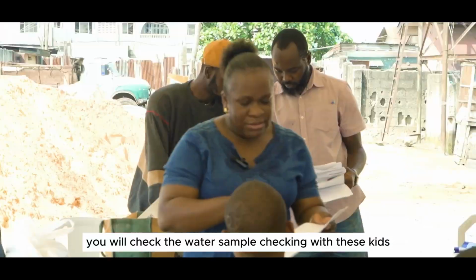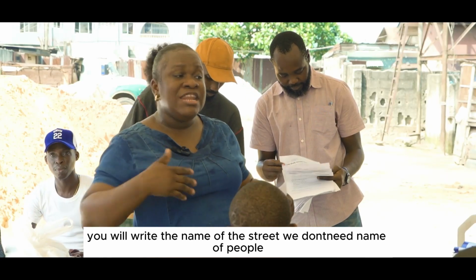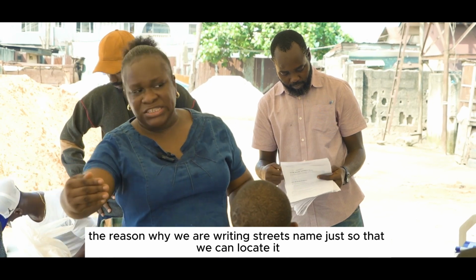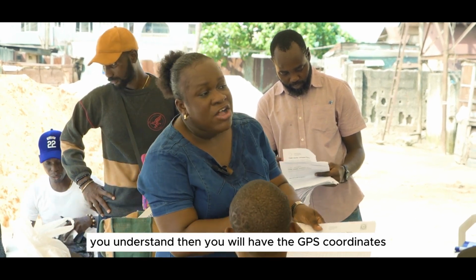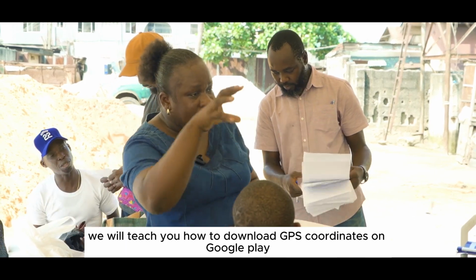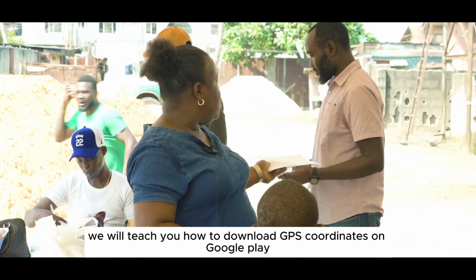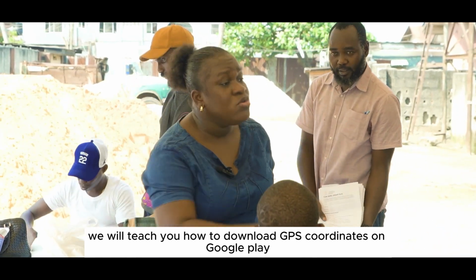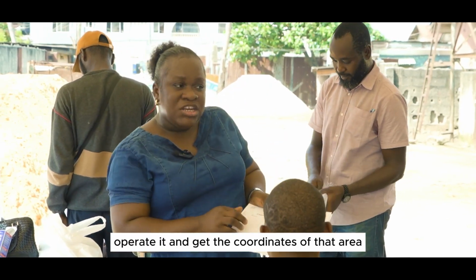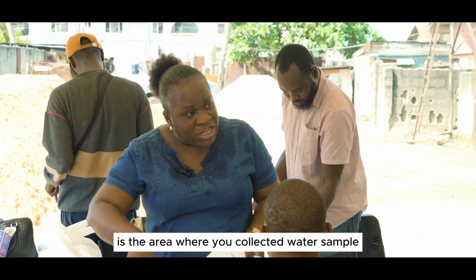You will take the water sample and check it with these kits. You will write the name of the street. We don't need names of people. The reason we are writing the street name is just so that we can locate it. You understand? Then you will have the GPS coordinates. For those of you with an Android phone, we will teach you how to download a GPS coordinates app from the Google Play Store. You download it, they will teach you how to operate it and get the coordinates of that area. Now, the area where you are putting the coordinates is the area where you collected the water sample.